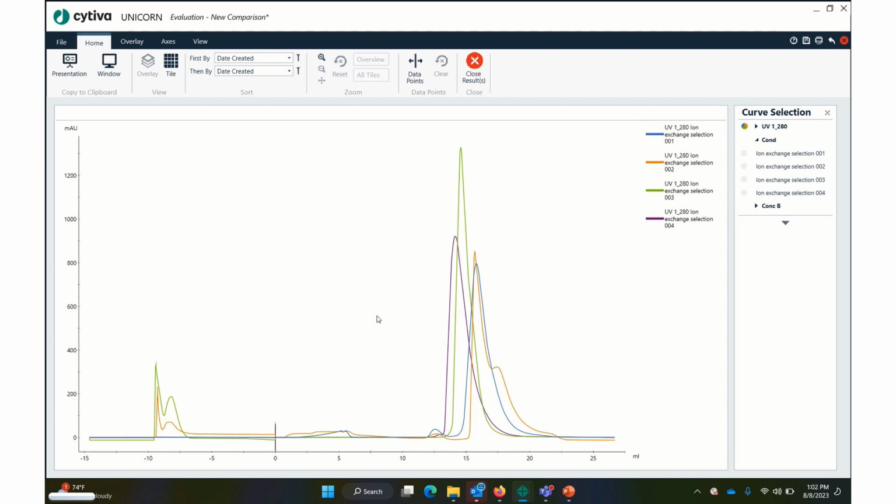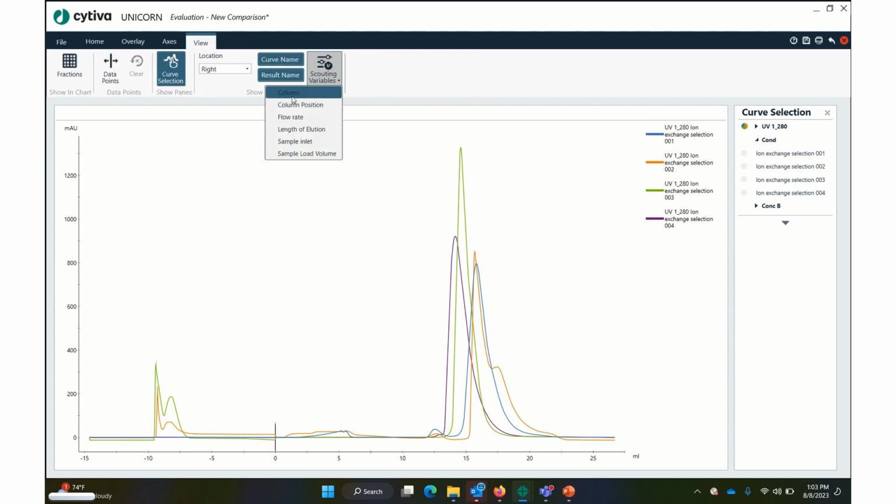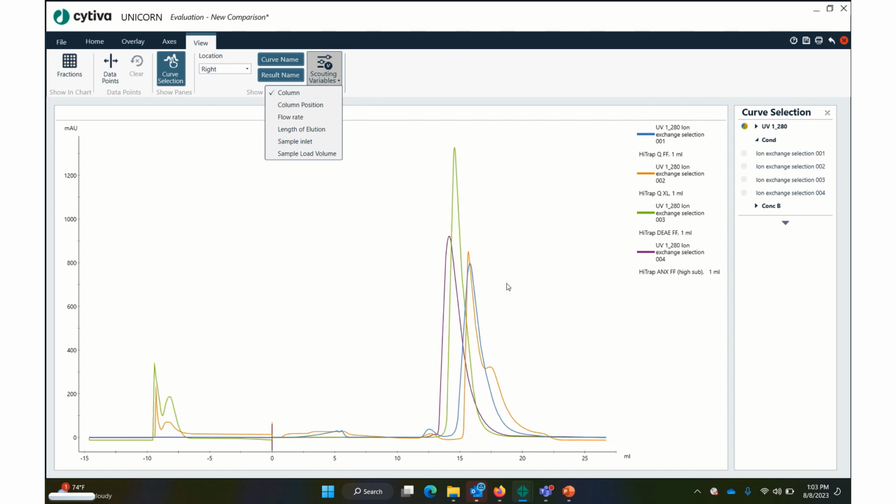The next thing we want to know is what chromatography resin this actually is, because this looks like it's the good one to do. So we're going to go to View and then Scouting Variables, and we're going to select Column right here. When we select Column, it's going to tell us what variable this was. So 2 was the HiTrap QXL column right here. That's the resin I think I would use at least. It looks like the HiTrap Q FF resin was able to separate out this blue species, and so was the orange one, the HiTrap QXL.